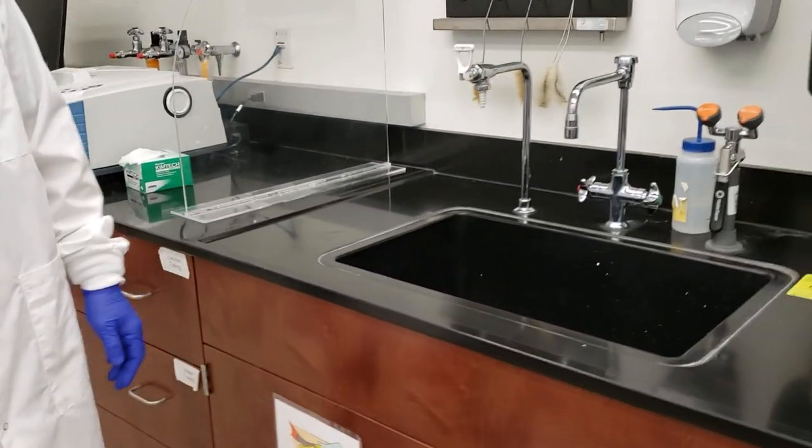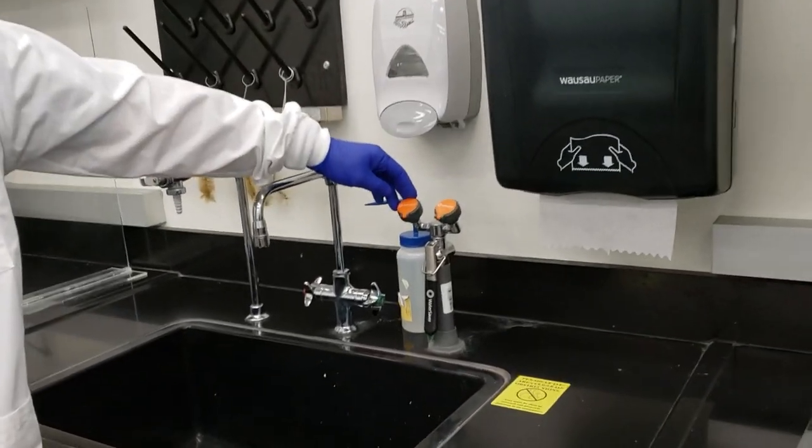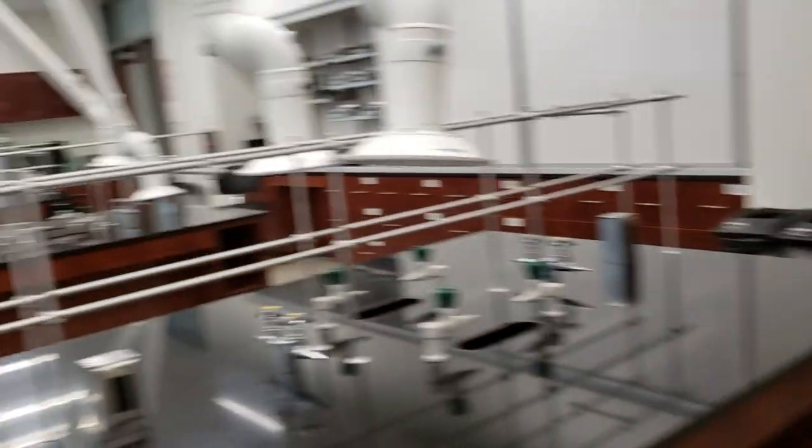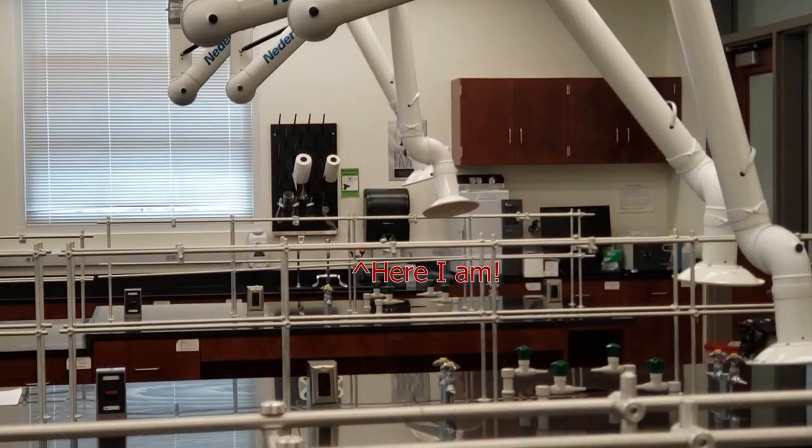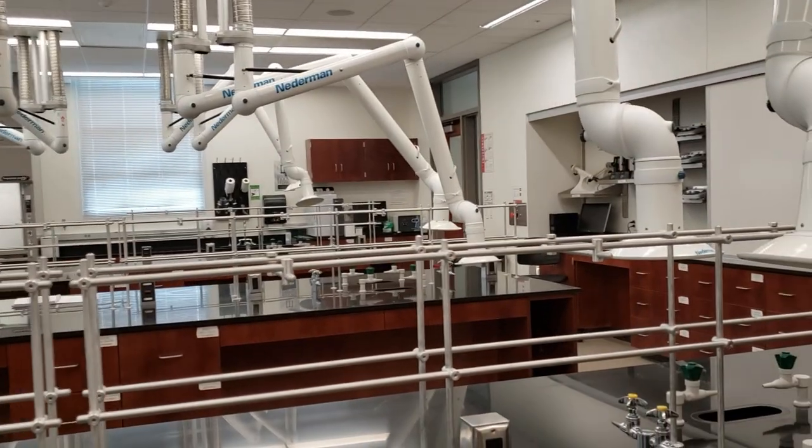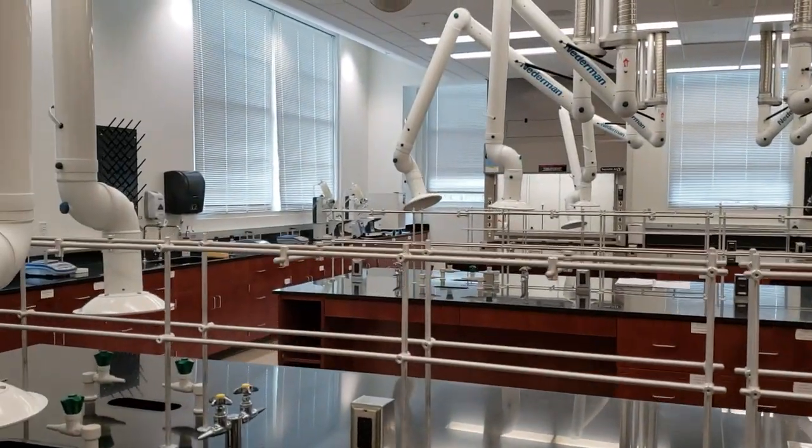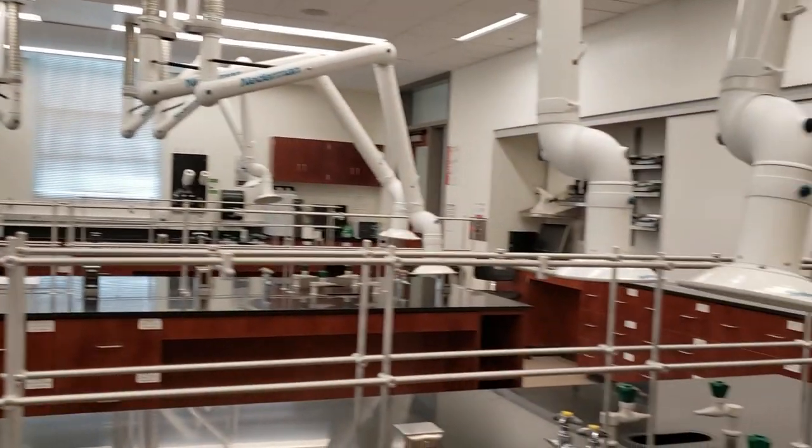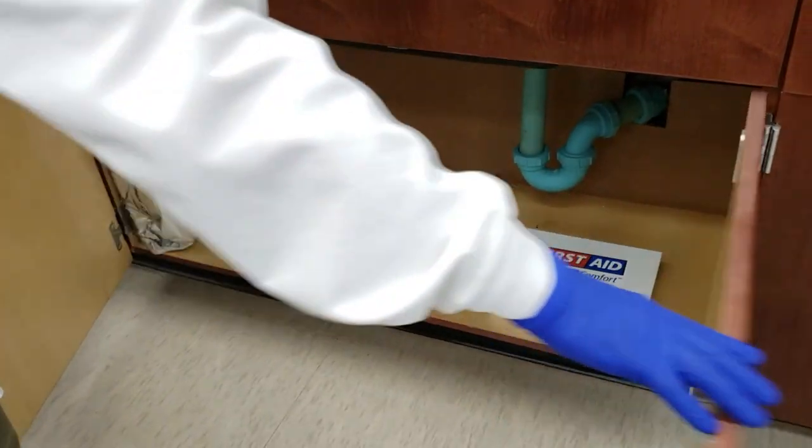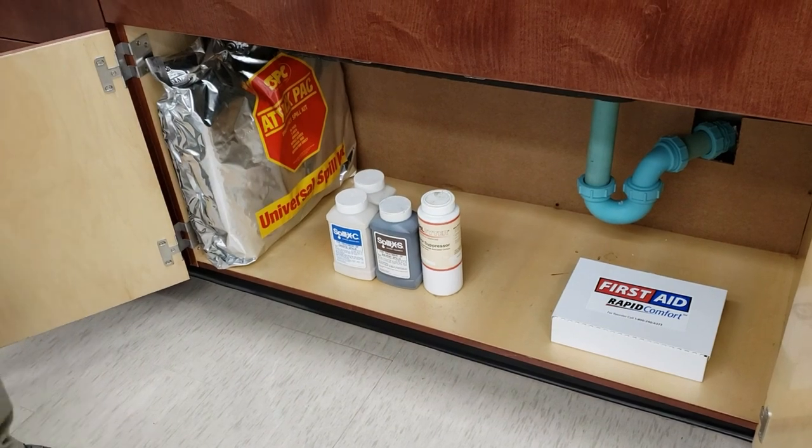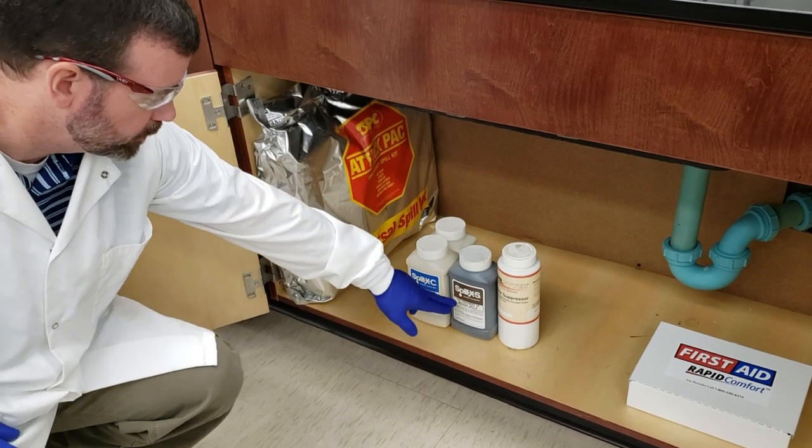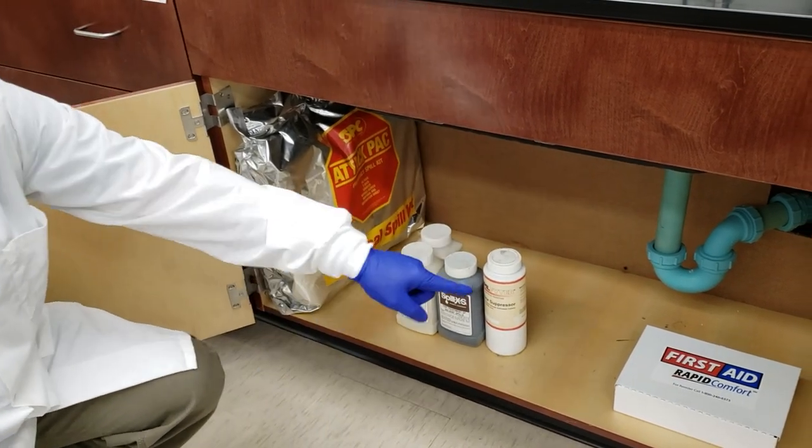First is our eyewash station attached to the sink. We have another eyewash station on the other side with orange caps. Those are the two eyewash stations in each lab. We don't have one on the back sink, so go to the side sinks if something occurs. We have our chemical spill kits and first aid kit underneath our sink, with absorbent barriers for significant spills. We have spill kits for caustic spills, solvent spills, vapor suppression, and our first aid kit.